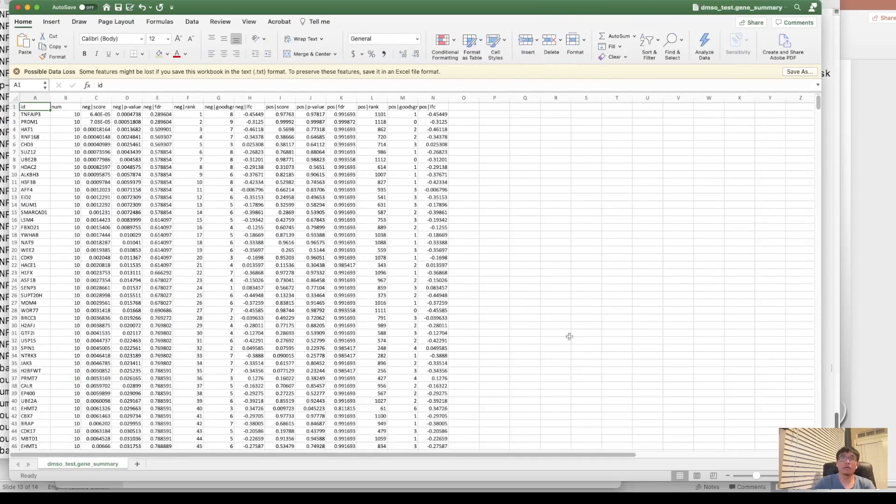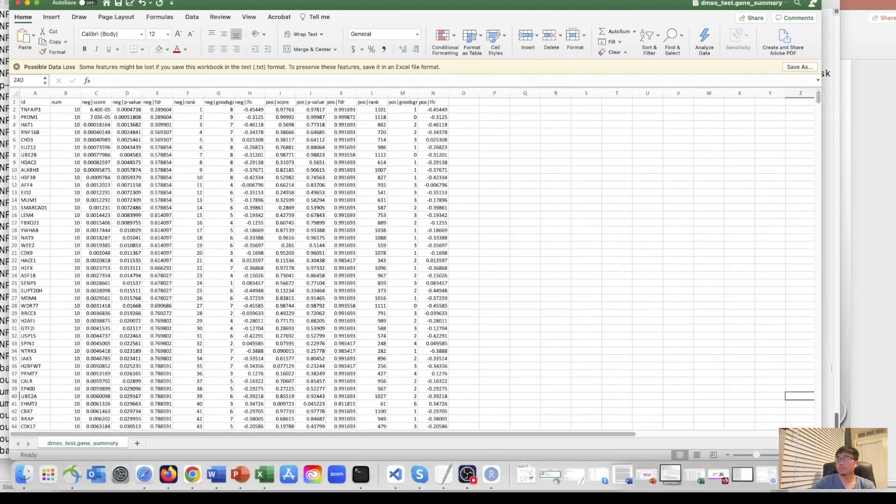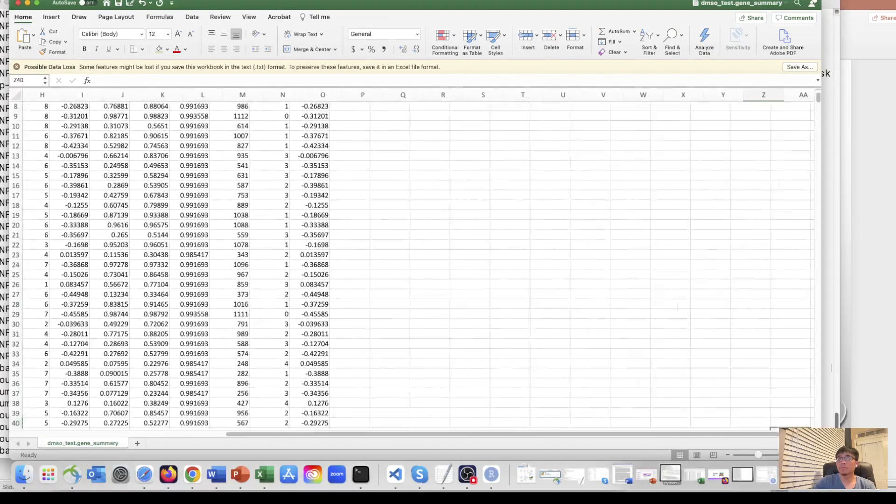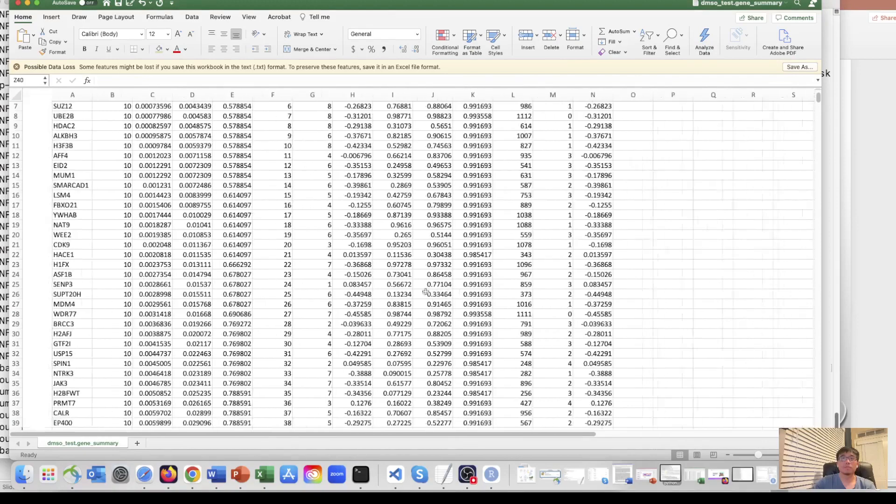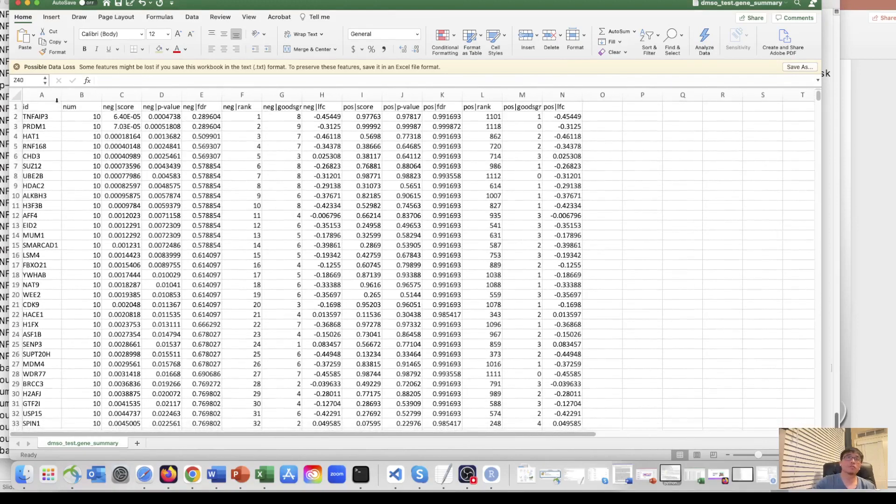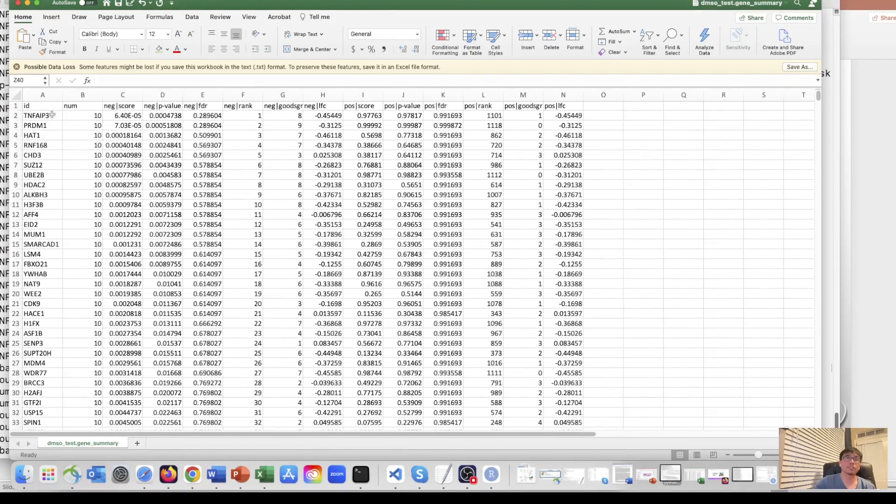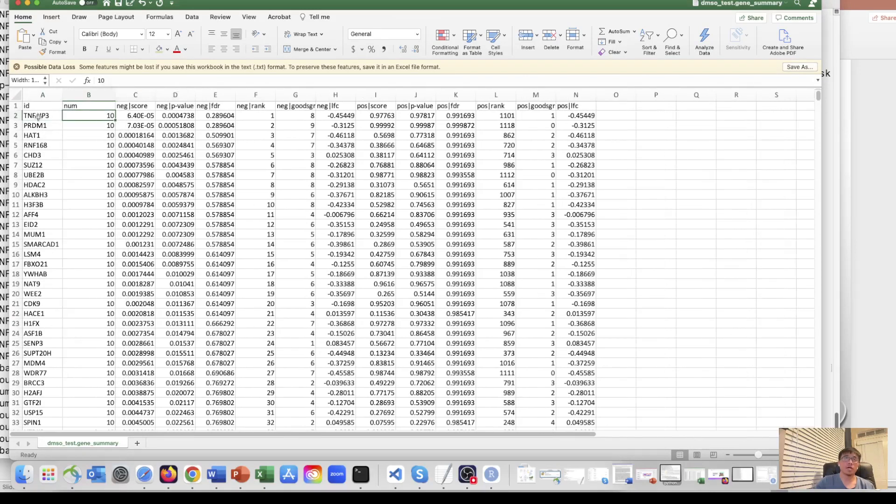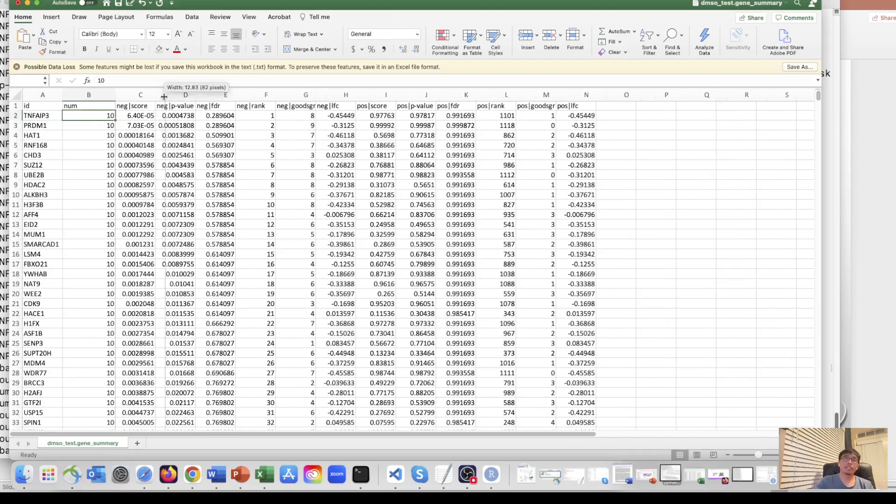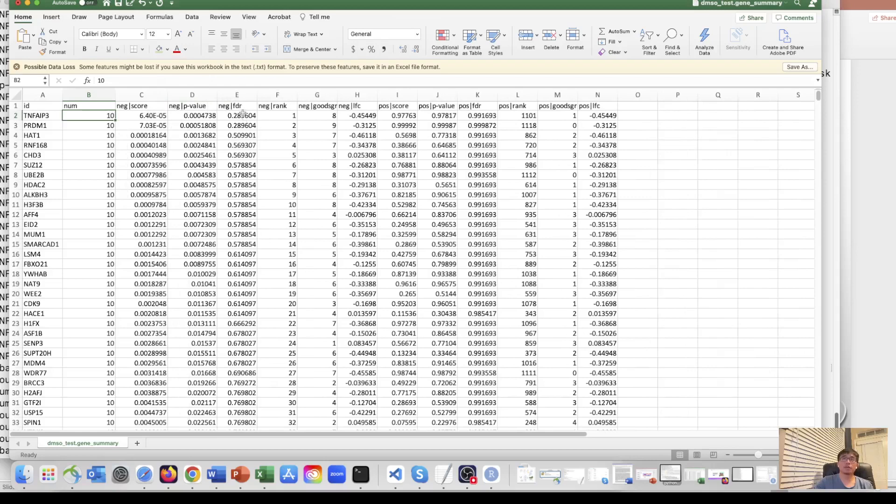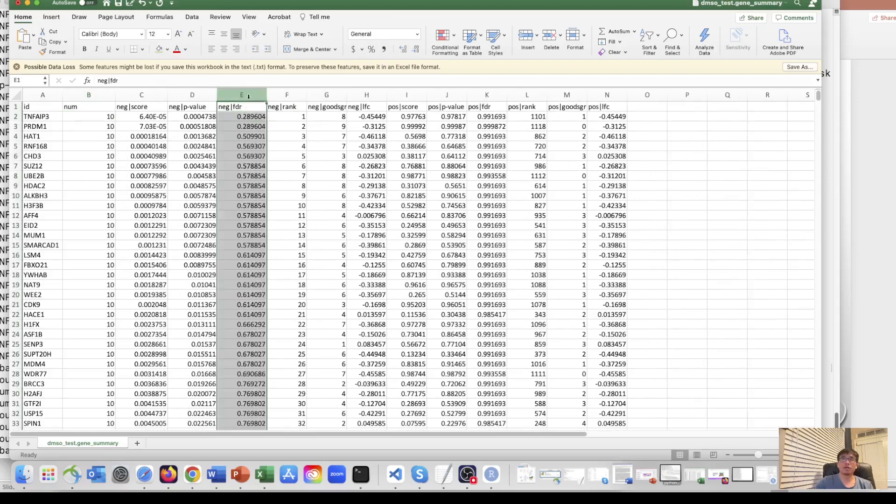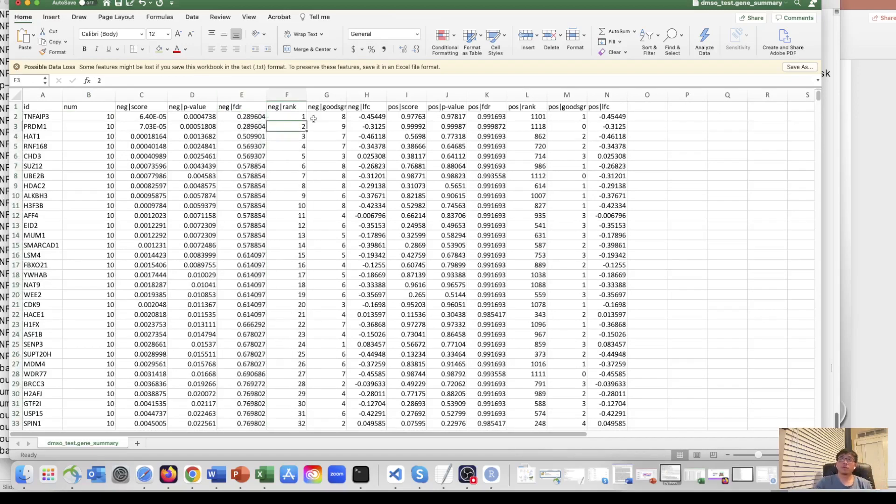It has different columns. So the first column is gene name. And the number is how many sgRNAs targeting this gene. We have 10 in our library and the negative score, negative p-value and negative FDR. We need to look into the FDR, the false discovery rate. So this is the negative selection and its log-fold change.